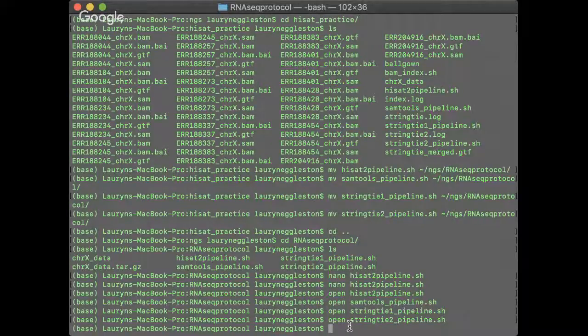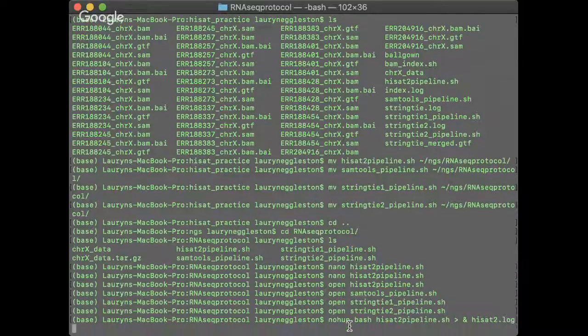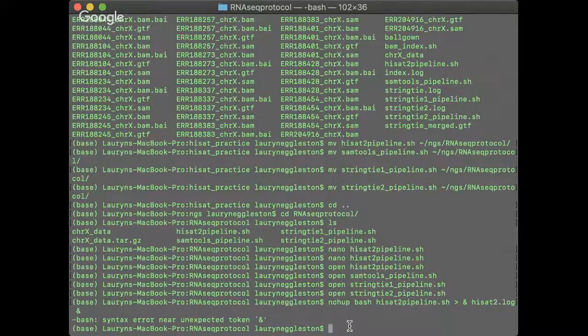I think that we should be good now. Hopefully no errors. Oh, did I put a space?